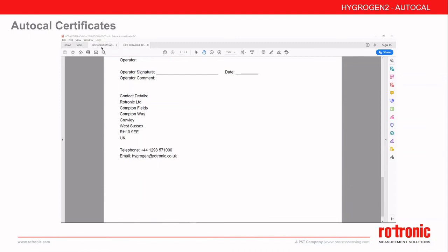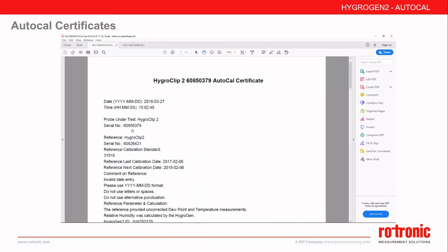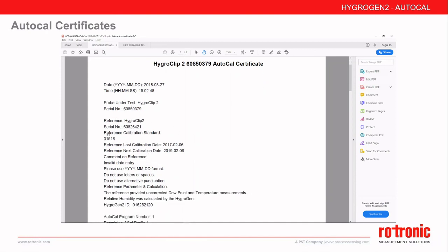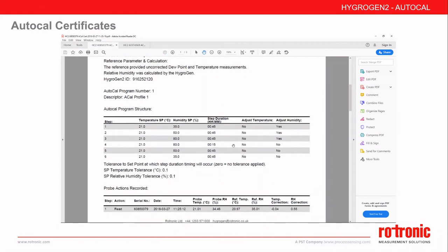Let's look at another certificate, which is a little bit more complicated. Again, the same summary information, with a little bit more reference information entered this time. In this example, there was a six-step program. The first three steps included the adjust humidity tag. Adjustment is only made at the last humidity reading, so in effect these first three readings are as-found results. Then the adjustment will be applied and the steps are repeated.